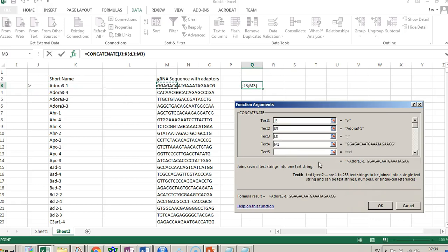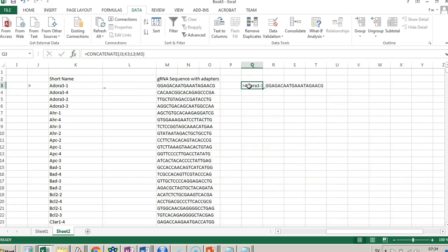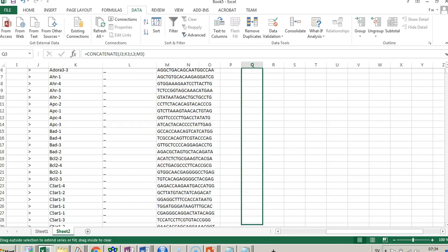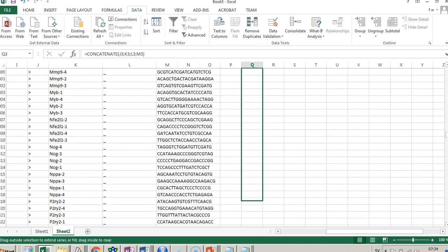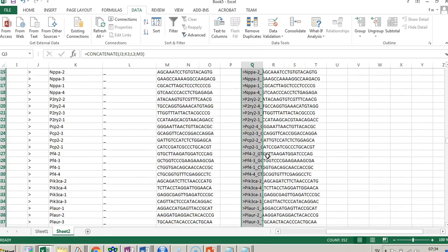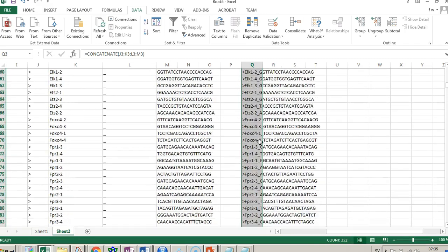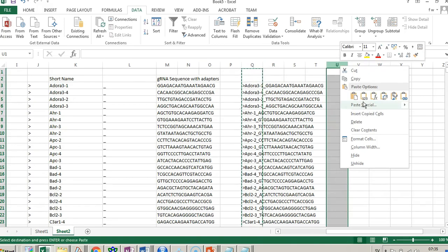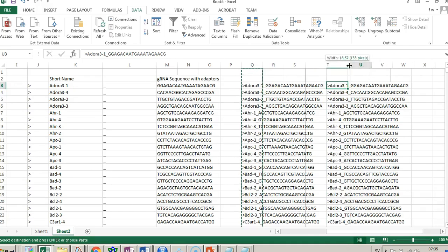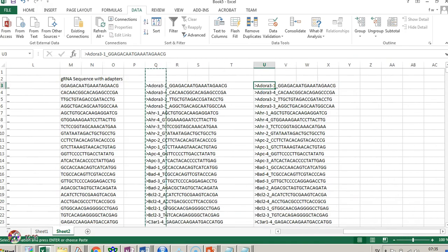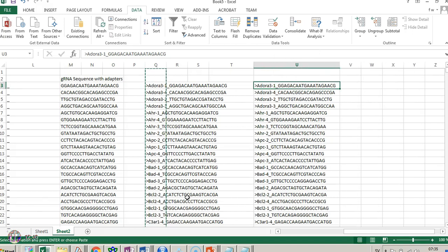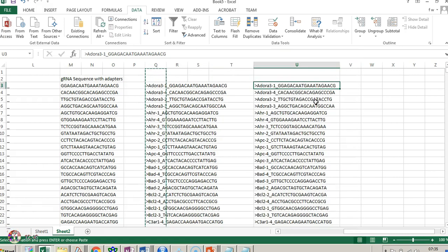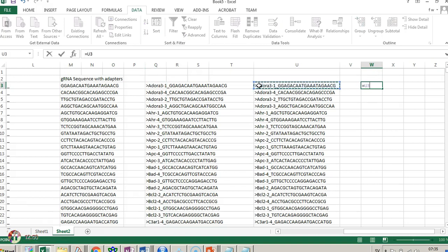Then we're going to use the CONCATENATE function — combining text from columns one, two, three, and four. We build the formula, pull it all the way down. You'll see we get the first-row identifier formatted correctly. Since this is a formula, you need to copy it and paste it as text so it becomes plain text.